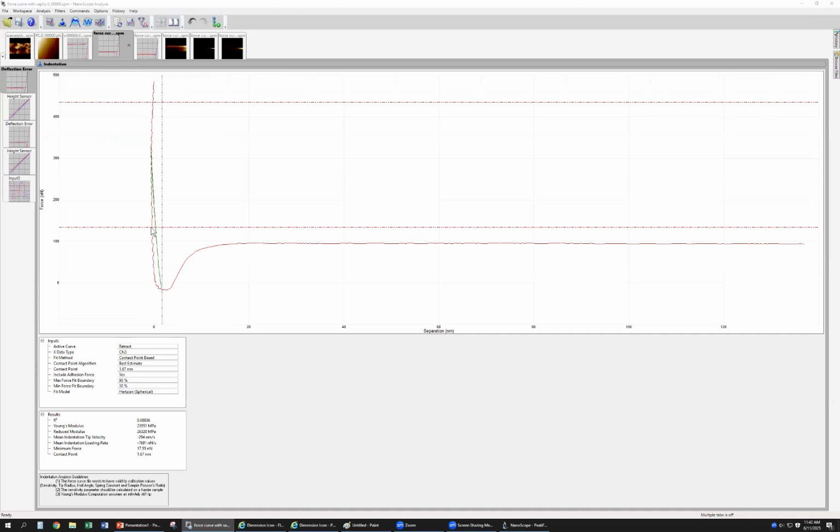Yeah, this depth is 0, that depth is 0. That means no any sample deflection, right? So that means this problem is solved. Okay. So now you can change your probe.